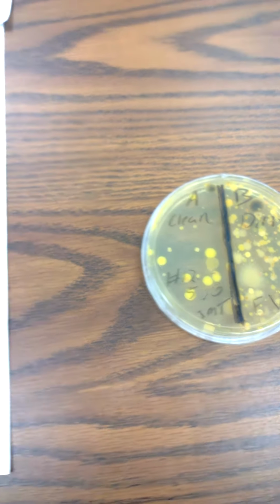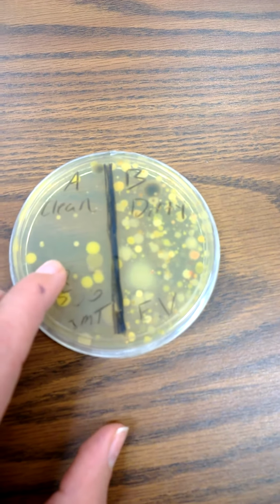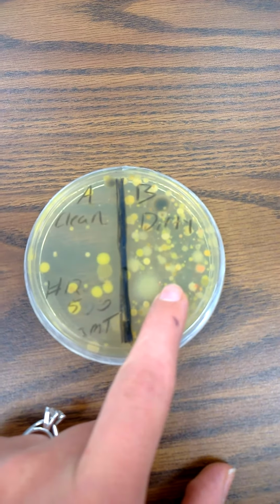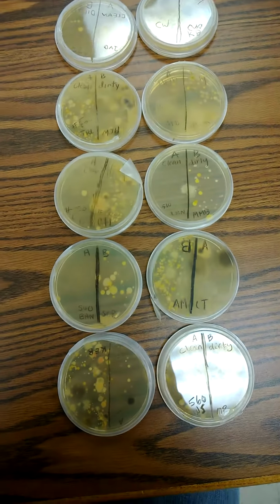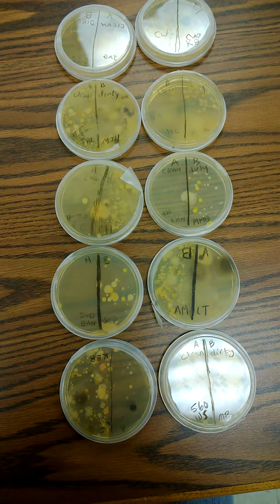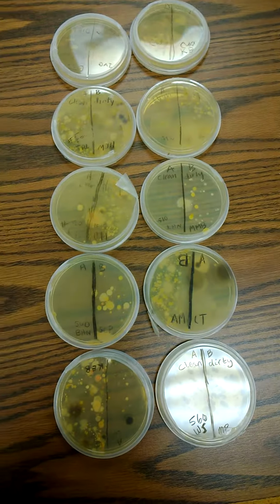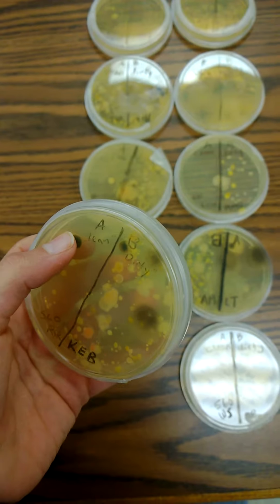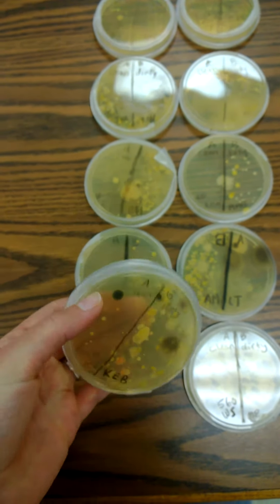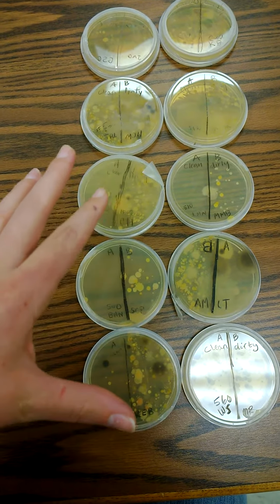As a class, we then would have counted how many bacterial colonies we have on side A and how many bacterial colonies we have on side B. We are going to say that we have 10 total petri dishes as a class. You and your partner would have picked up one petri dish and done the counts for side A and the counts for side B. We're going to say that we have 10 petri dishes as a class to complete this worksheet.